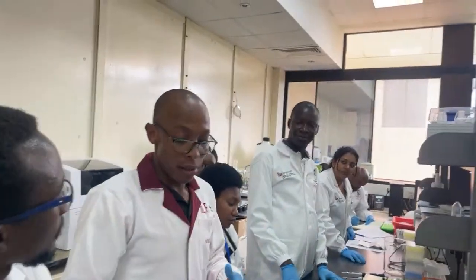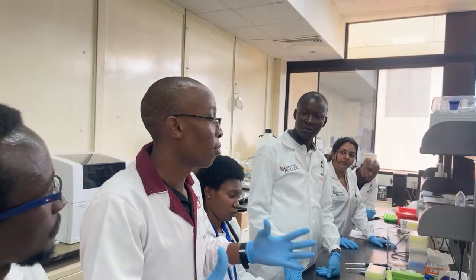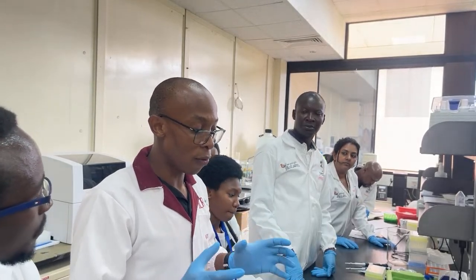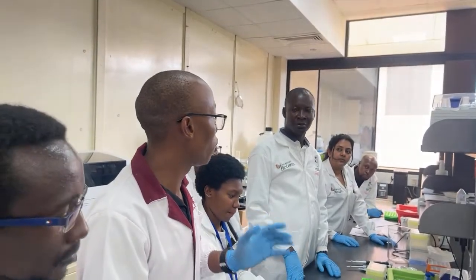And maybe for users of the PacBio platforms and other long read sequencers, would we recommend the high molecular weight DNA extraction kits for such applications? Yes. So like I said, what we are working with here is a fish, right? It's anything that is over 500 megabases. You rather want to work with high molecular weight, right? And remember, the advantage of these huge genomes, as I've mentioned earlier, is you want to get high molecular weight so that you can get the maximum output out of the SMRT Cell.